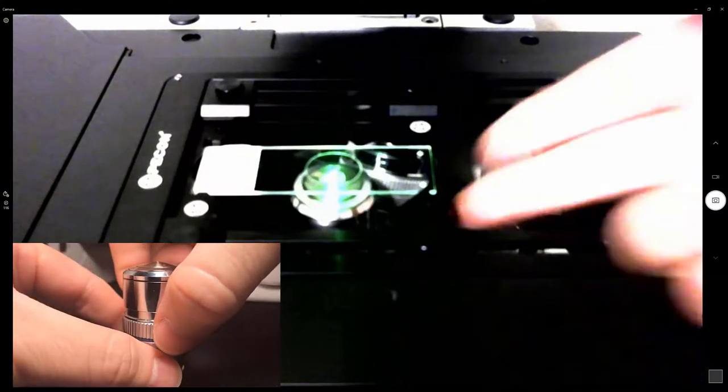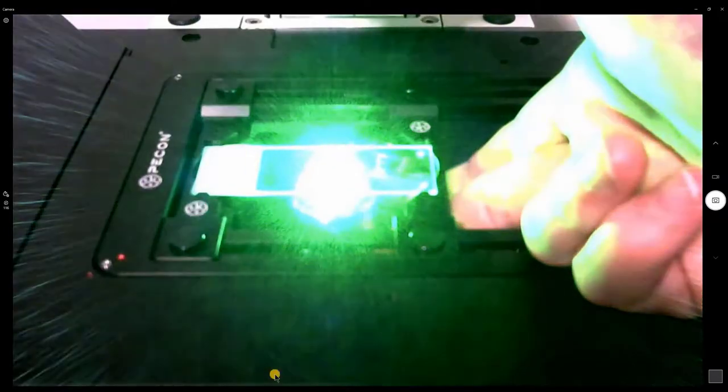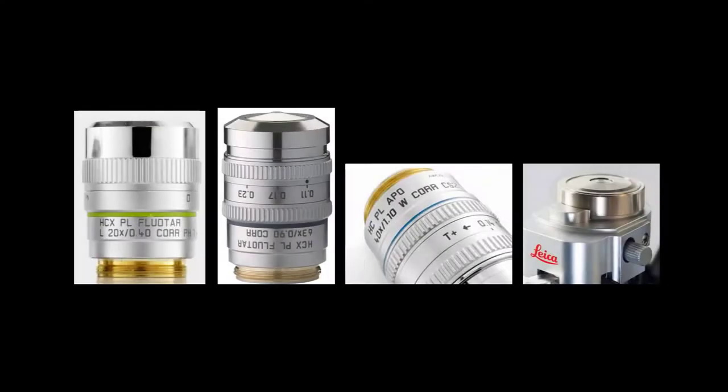Another method for adjusting the iris is to view the intensity of the light coming from the objective. When at maximum brightness, the iris is fully open. Thank you for joining us today — please make sure to always check your correction collars.